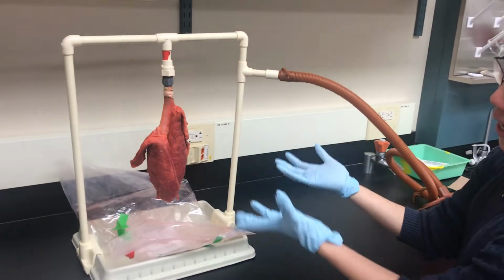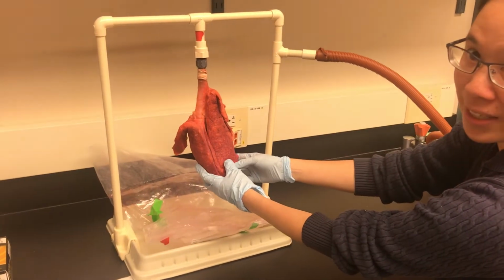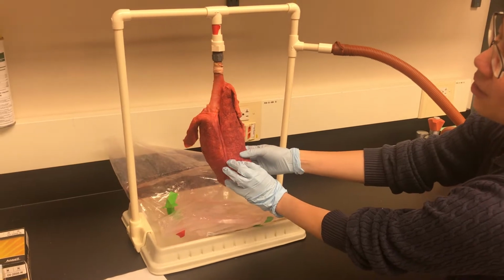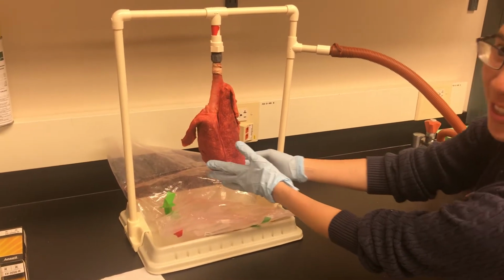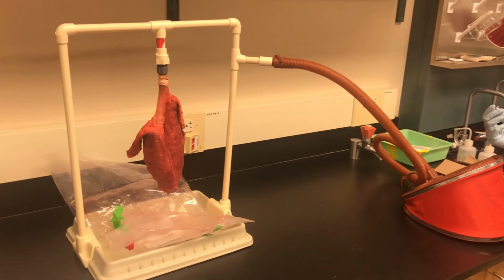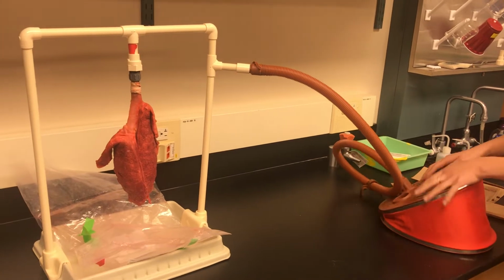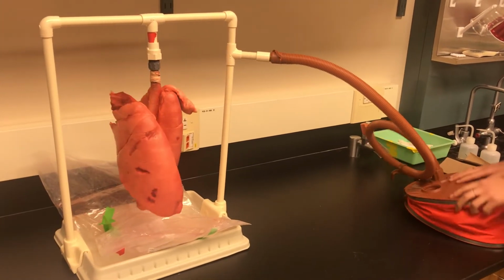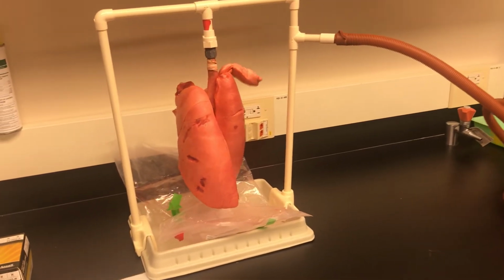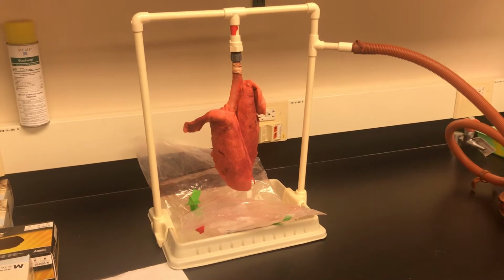So this is a pig's lung, and you can see the alveoli in the different lobes here. It's actually really, really soft, okay? So it's like tiny little air sacs, kind of like a mattress. So, Jessica, would you like to do the honors? We're just inflating it. Yeah. So that's great.